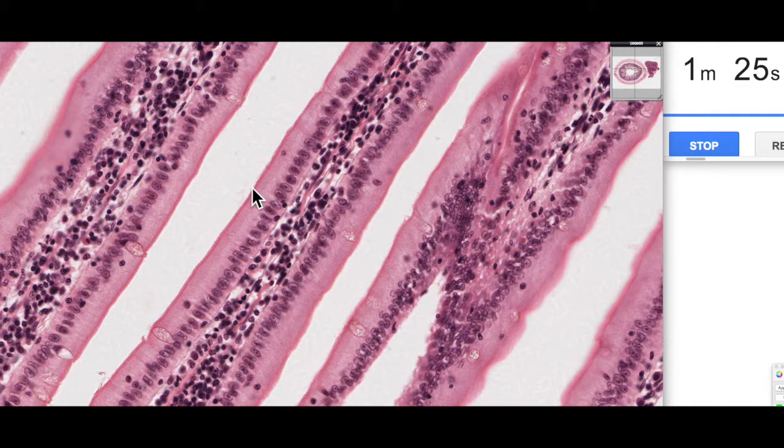You might notice that along the surface here we've got this very acidophilic little border. This is referred to as a brush border and represents the microvilli on the surface of these absorptive cells. They're acidophilic for two main reasons. One is they tend to have digestive enzymes associated with their cell membranes, and enzymes are proteins that stain with eosin. The other reason is that in the core of each microvillus is a core of actin or microfilaments, and actin is a protein that also stains with eosin.